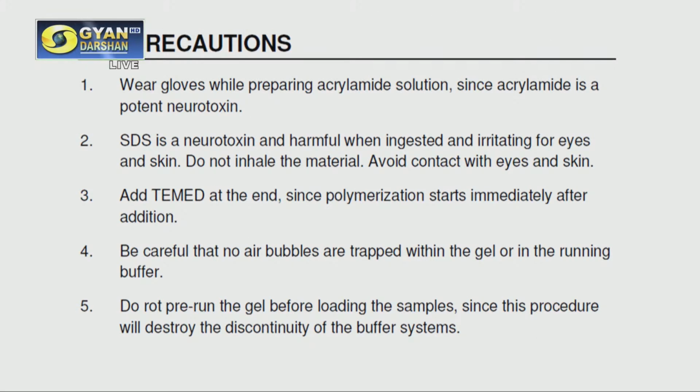Finally, before I conclude, again the precautions. You should handle acrylamide and bisacrylamide with care, because these are neurotoxins. So you should always wear gloves. SDS, it is also a neurotoxin. So avoid ingesting it, and it might cause irritation to eyes and skin. Do not inhale the material.